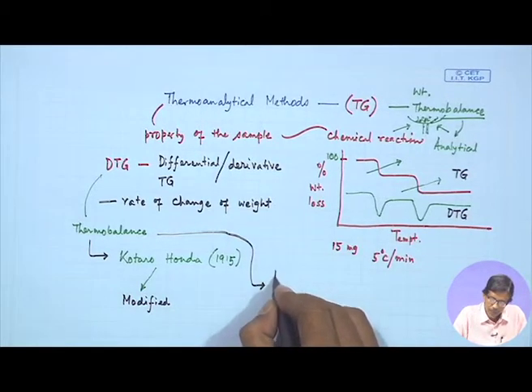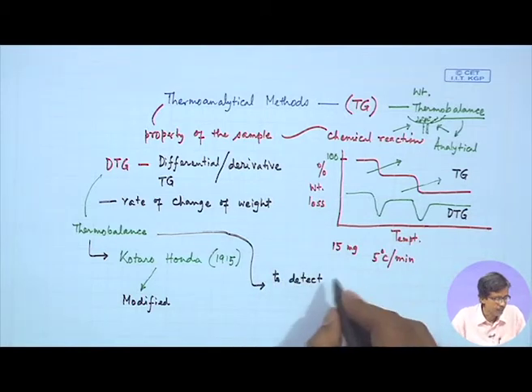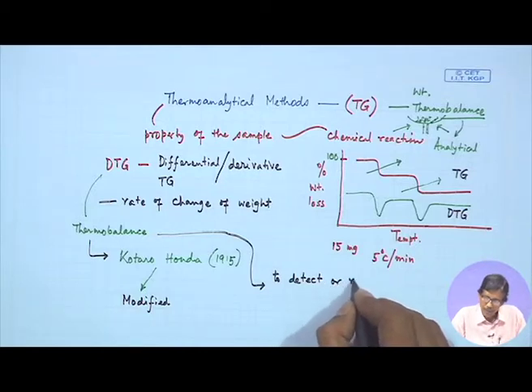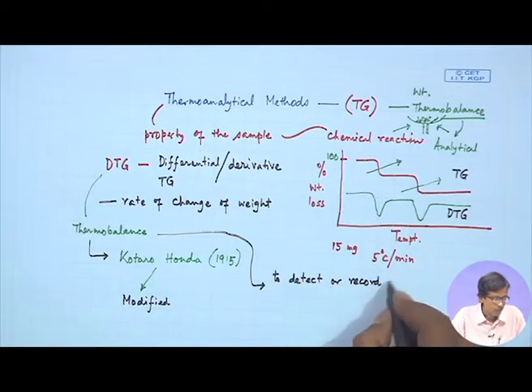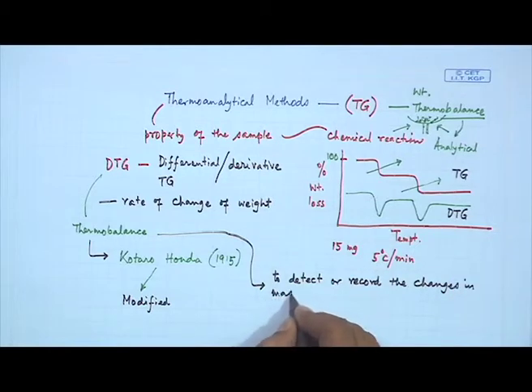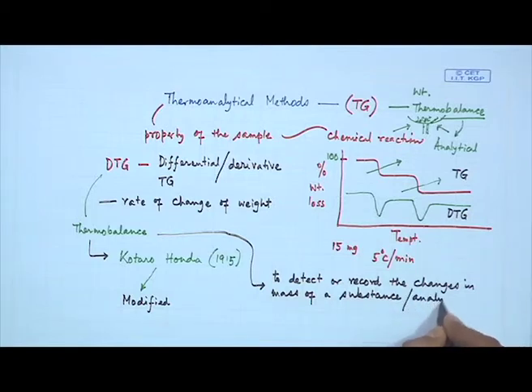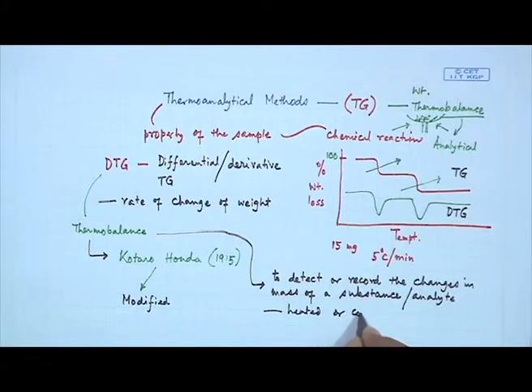It can detect the weight change, or at the same time it can record the changes in mass of a substance, which is your analyte, which is being heated or cooled.